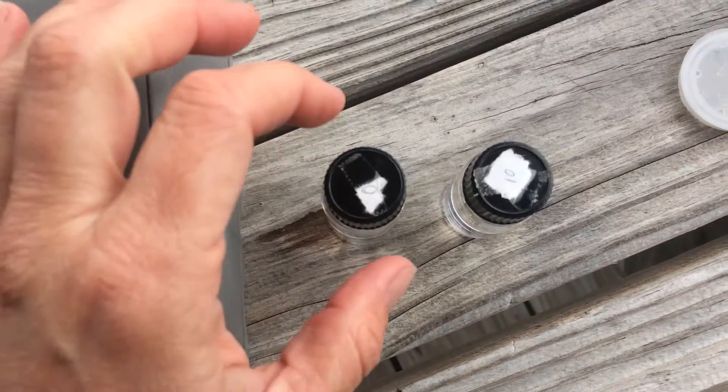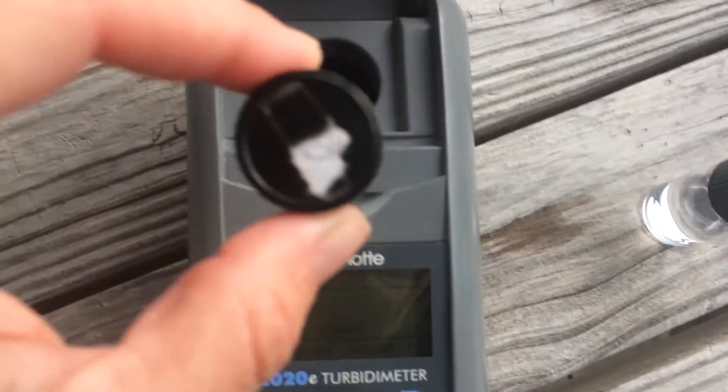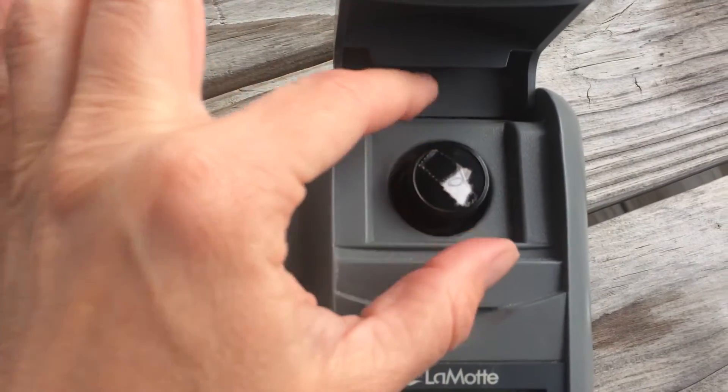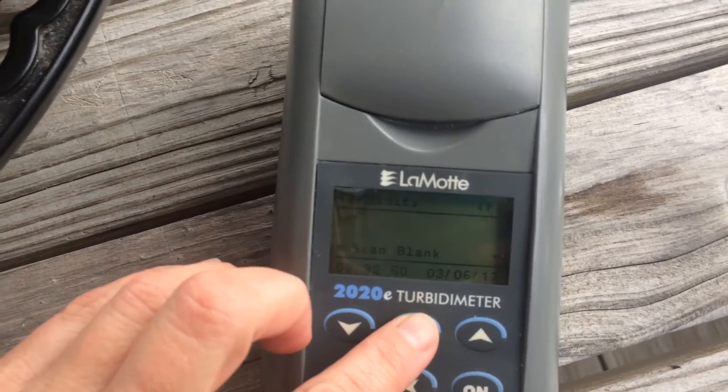It says scan the blank. The blank is the one with the zero. Try not to touch the bottle — if you do, you can wipe it off with the cloth. Then hit scan the blank.